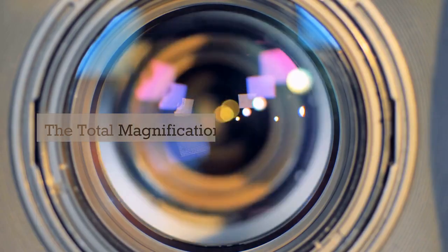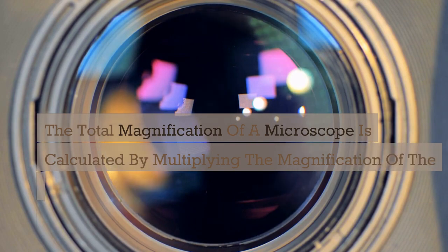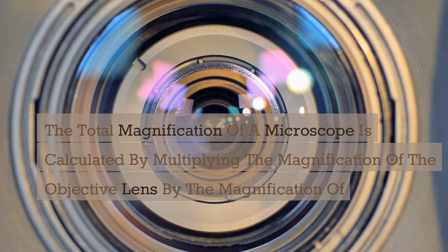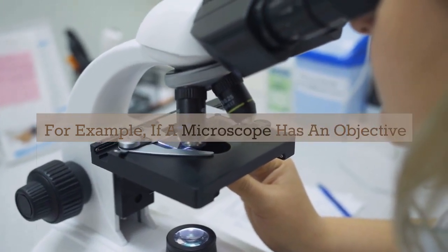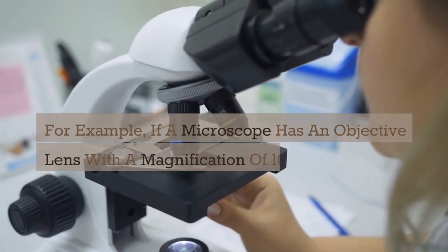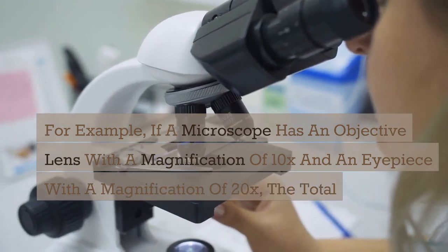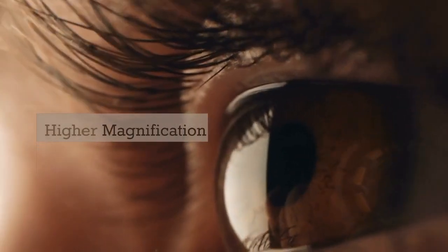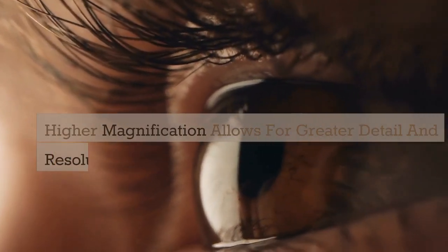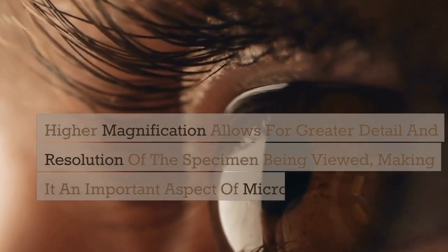The total magnification of a microscope is calculated by multiplying the magnification of the objective lens by the magnification of the eyepiece. For example, if a microscope has an objective lens with a magnification of 10x and an eyepiece with a magnification of 20x, the total magnification would be 10 times 20 equals 200x. Higher magnification allows for greater detail and resolution of the specimen being viewed, making it an important aspect of microscopy.